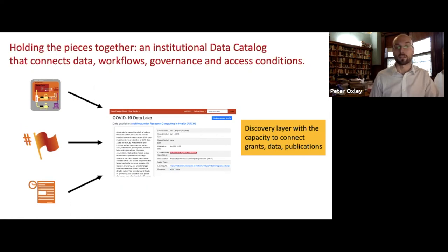to try and develop. And then finally, the unique tags associated with each of the electronic lab notebooks are also stored within the catalog, so that any notebooks that are used as part of a project or as part of a publication can likewise be tracked down, enabling a request to be made to the PI or the faculty member to share access of that lab book with the appropriate researcher if necessary.